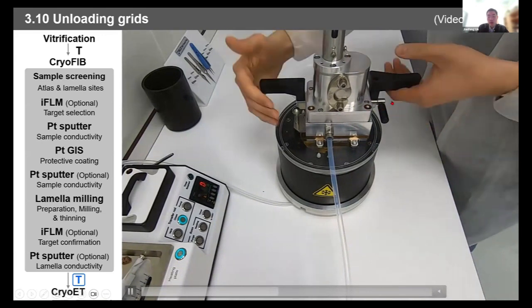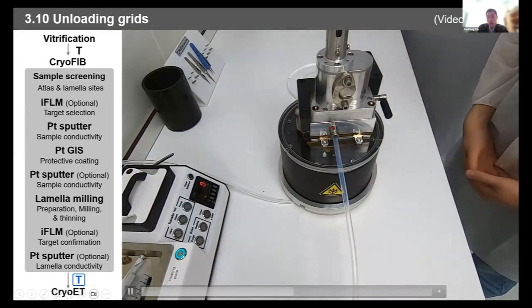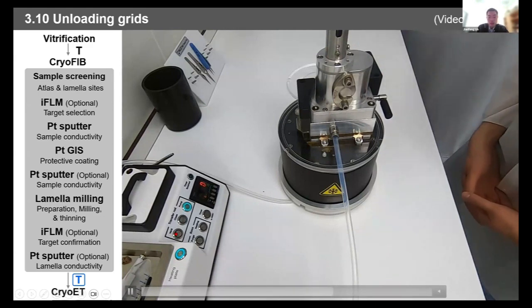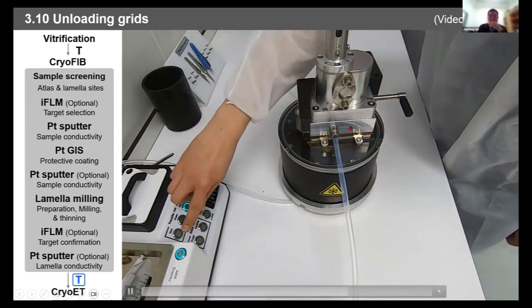And before you open the valve, you still will pump the bottom part of the valve, because you don't want the moisture inside it to go into your chamber where your sample is. When the pumping is ready, the light will flash quickly and remind you it's ready, and then you can vent. Open the valve and vent.